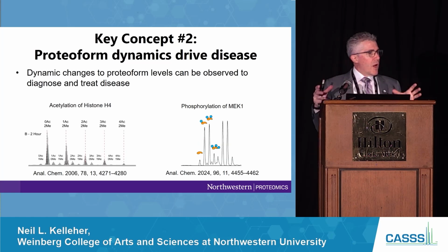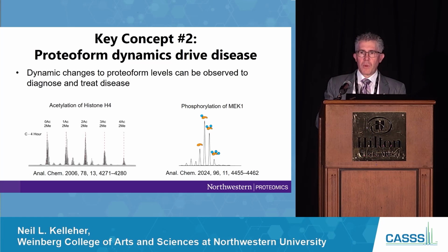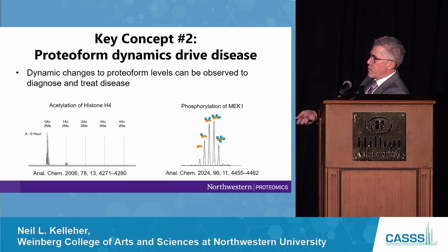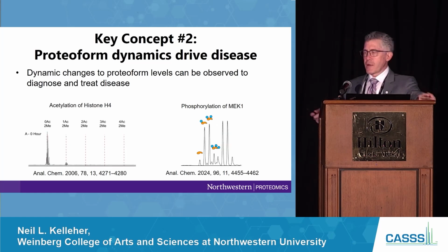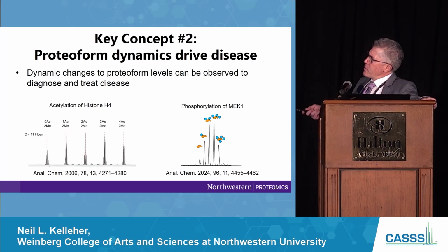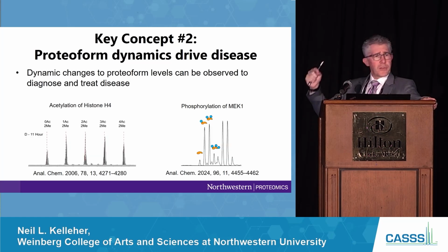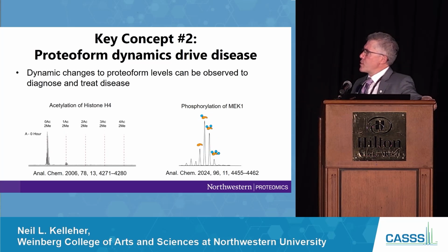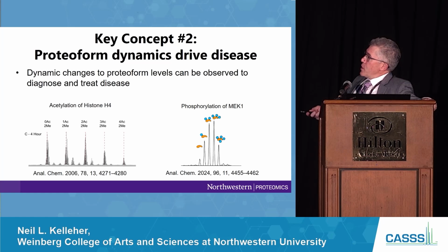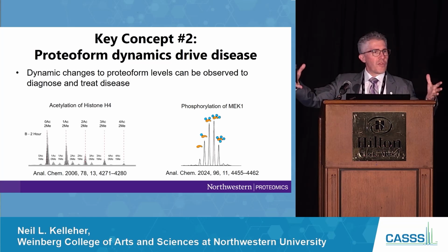Five years ago, we did not have the tools to localize all those phosphorylations. Now we do. You get further in, and that's in this paper that just came out. And I encourage you to read about that, and I'll tell you about the underlying technology in just a bit. But the thing you get here is not just correlation to cellular or cancer phenotype in terms of aggression, doubling time, tumor size. You get stoichiometry. In a single spectrum, you get the relative amounts of 1, 2, 3, 4 phosphorylations.